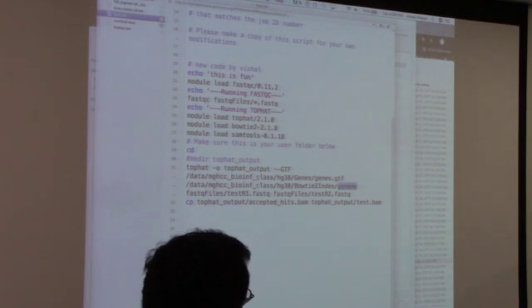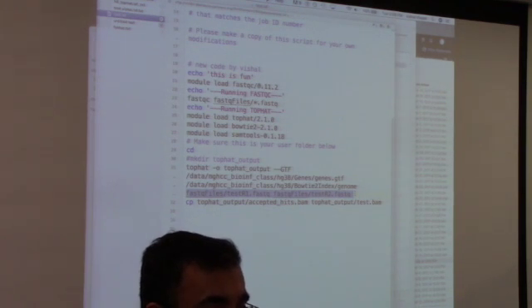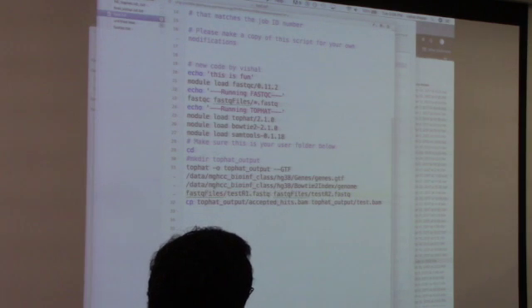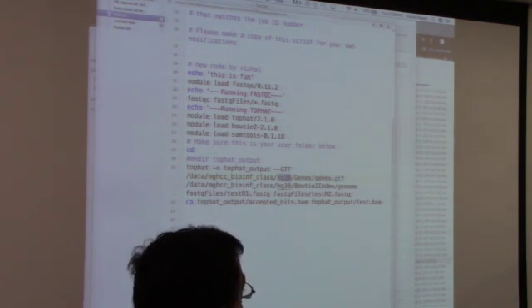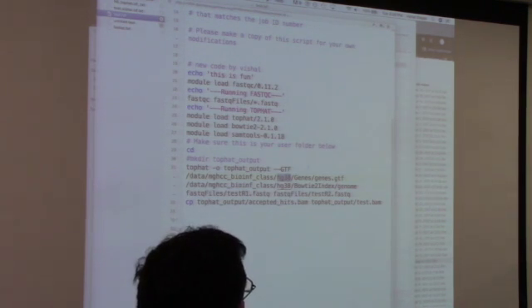The test files you actually have. You have the FASTQ files, test.r1 and test.r2, from before. You guys remember having these files in your FASTQ files directory? So what I'm going to do is copy this into temp, and you are going to copy from that the HG38 directory onto your home directory. And I'm going to give you the command for that. Just give me 1 second.